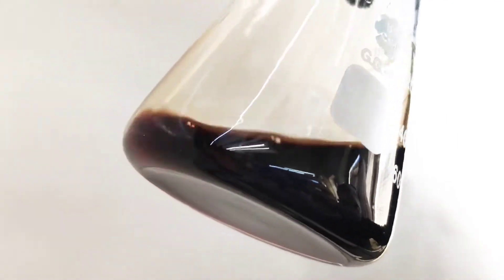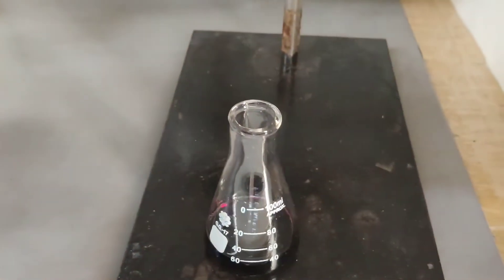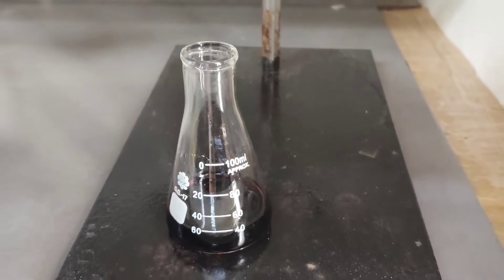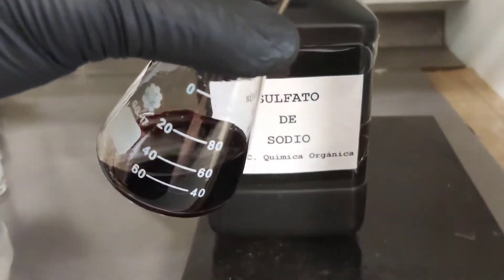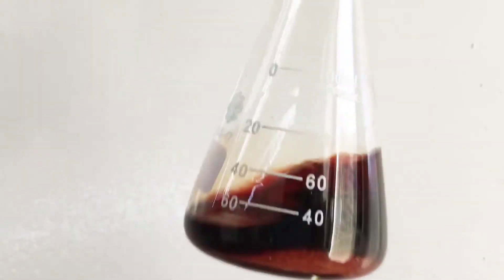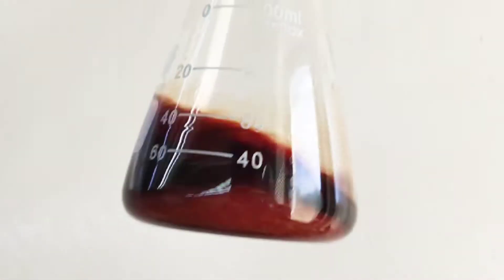Against the light we can see the red color much better. To remove the water we add some sodium sulfate into the solution and then we stir the solution and let it stand for a few minutes in order for the sodium sulfate to suck up the water.